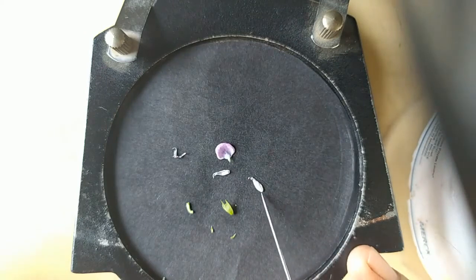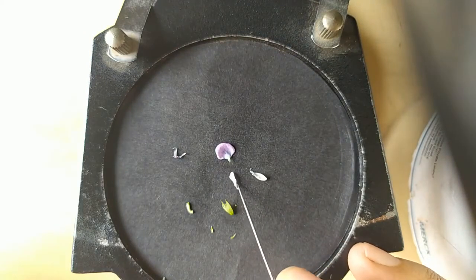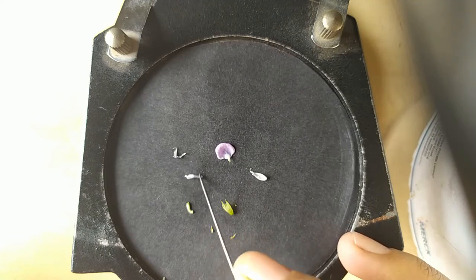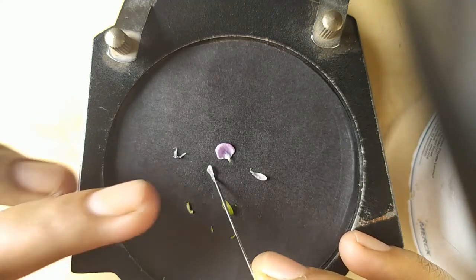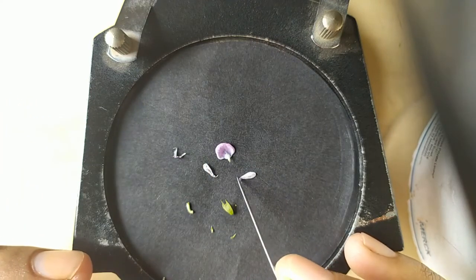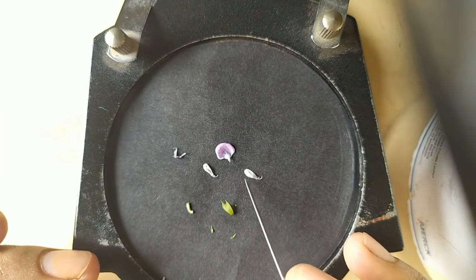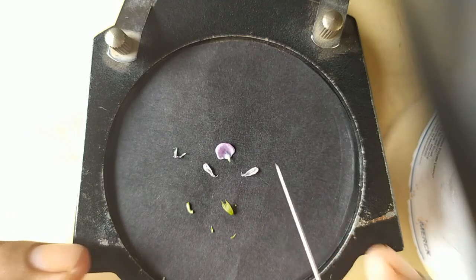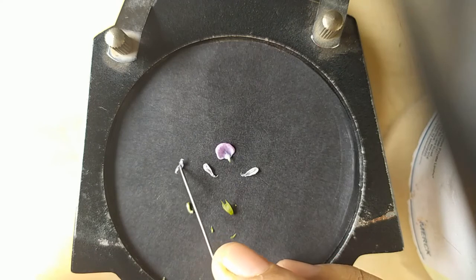Now these are the wings. Arrange them in the inward position. And these ones are the keels.